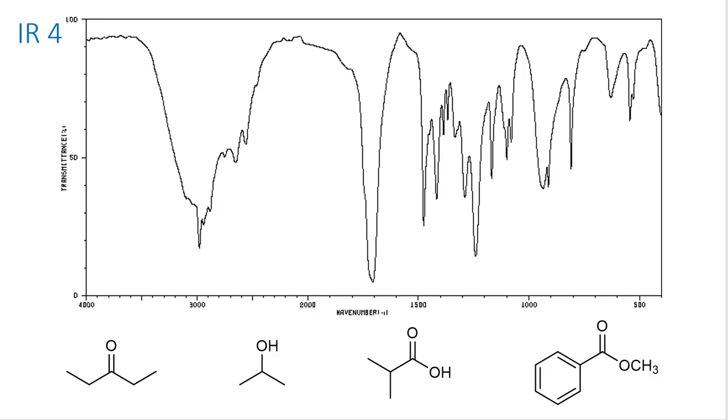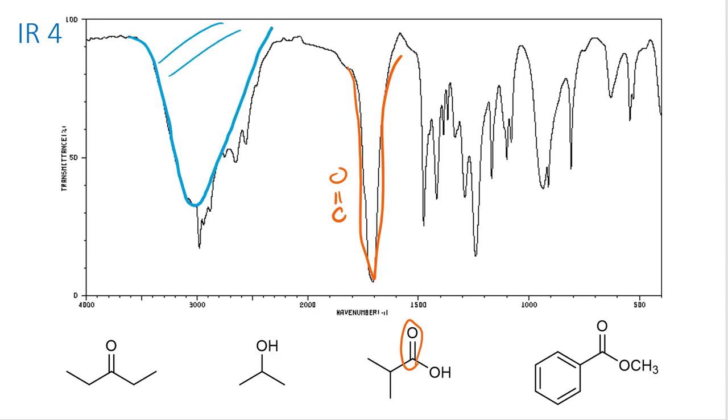Now it's easy to see that we have a carbonyl in this case, and that makes sense given the carboxylic acid's carbonyl. Remember that carboxylic acid OHs tend to absorb right around 3000 wave numbers, and those absorbances are broad, like all OHs and NHs typically are. That fits that pattern, but it's right in the middle of the range where we have our CH bonds absorbing.